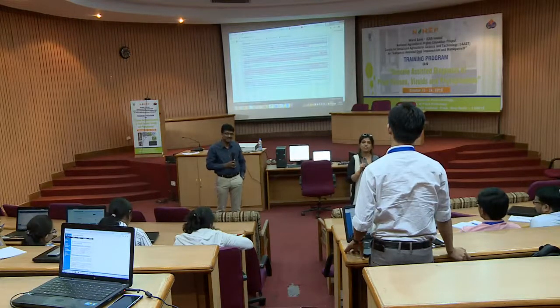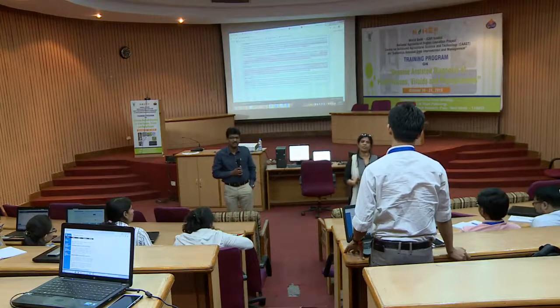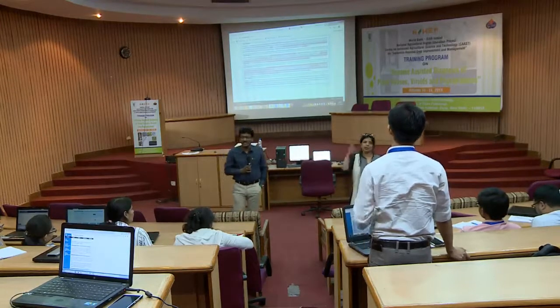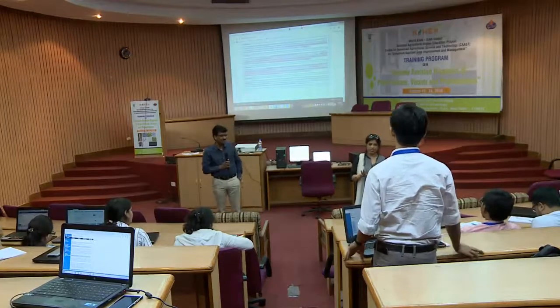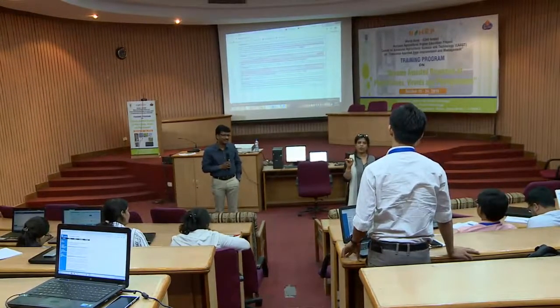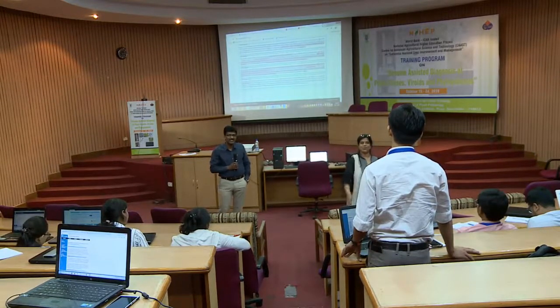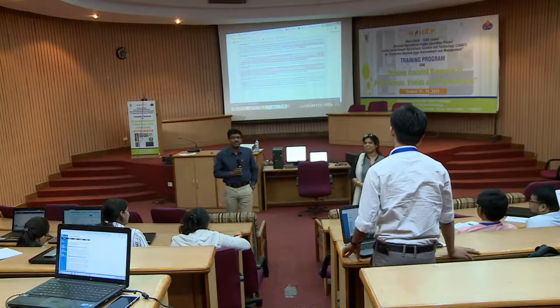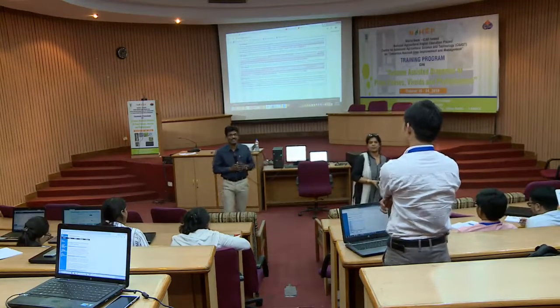That is one of the reasons they want the quality check; nobody can now send the sequence as such. Maybe the earlier entries must be there, but right now we have faced this several times: if any problem is there at any point, they will not give you an accession number, so how will those entries go there? Yeah, the databases are populated by all of us, correct?